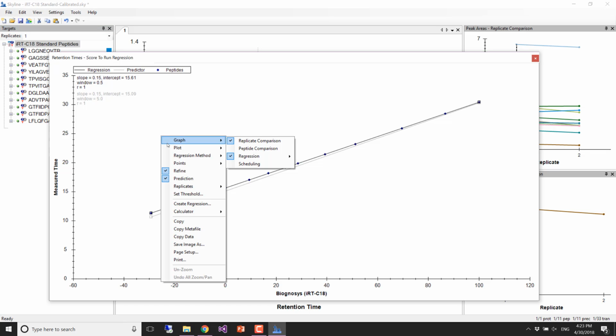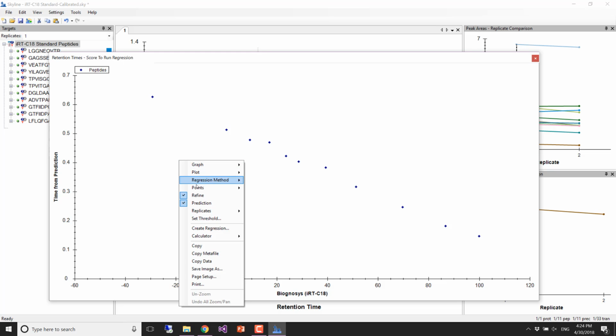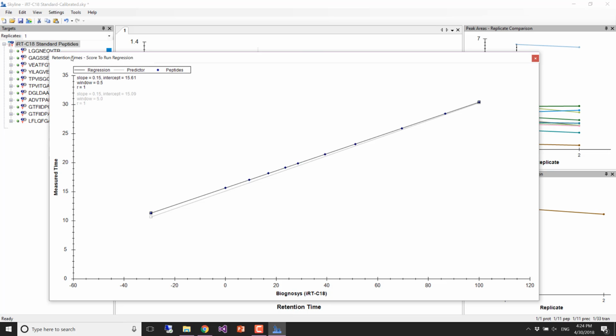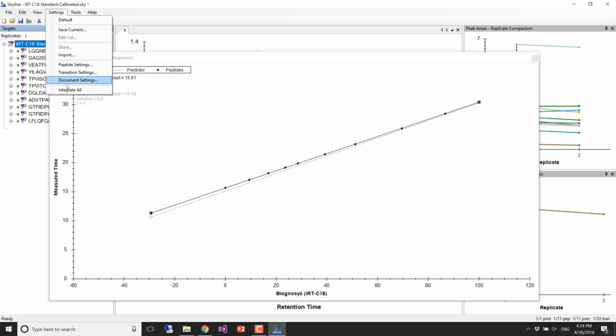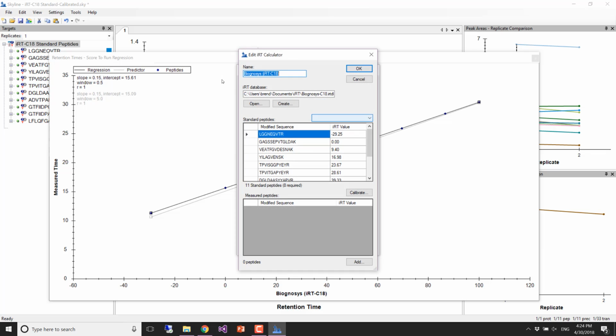If I actually, I guess I can also choose to plot residuals. Whoa. Okay, I don't know what's going on there. So let's go back. I'm getting too far afield. Plot correlation. So I'm going to go back. Hopefully nobody else did that. But you can see how all the points are really on the line because I calibrated them onto the line.